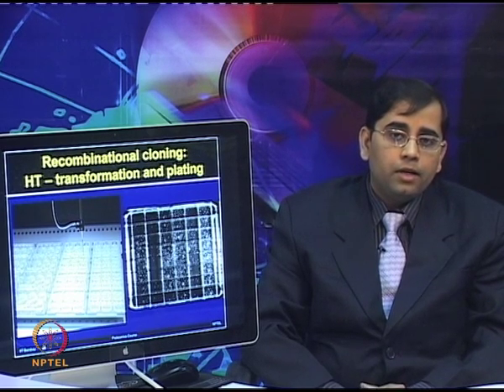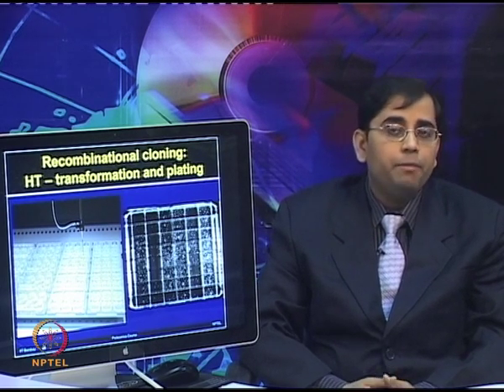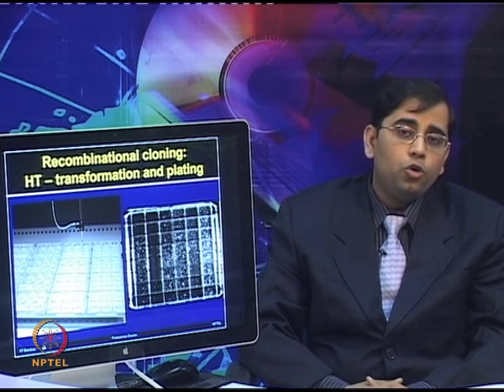So, in recombinational cloning, the high throughput way of doing transformation and plating is very crucial. It provides the automation during the bacterial plating, and colony picking reduces the error rates.